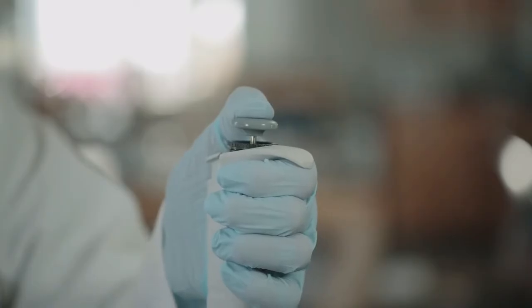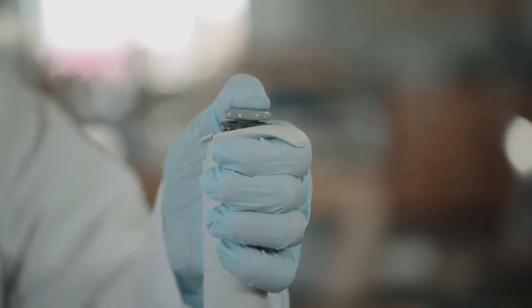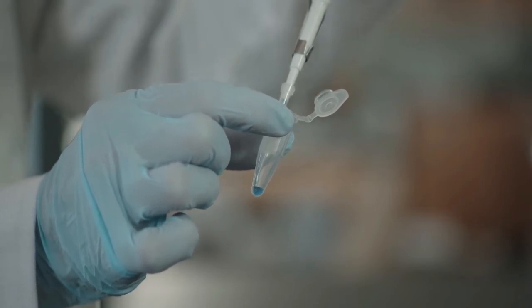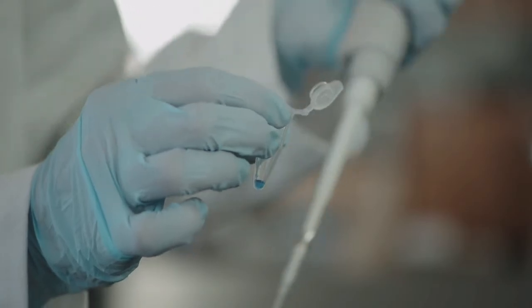To remove the last bit of fluid from the pipette tip, push past this first stop to the second stop. This will expel any liquid remaining in the pipette tip. Hold down the button until the tip is no longer touching the fluid. Otherwise, you may aspirate the fluid back up into the tip.